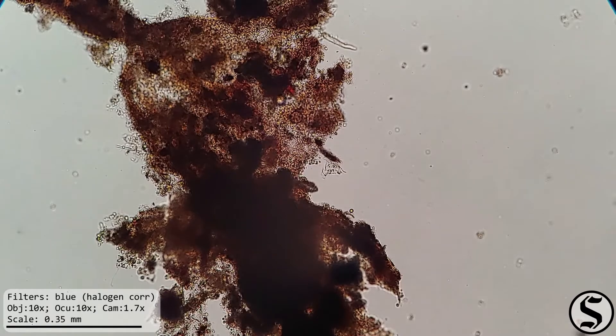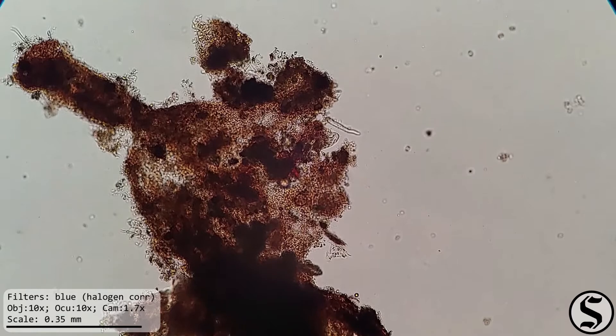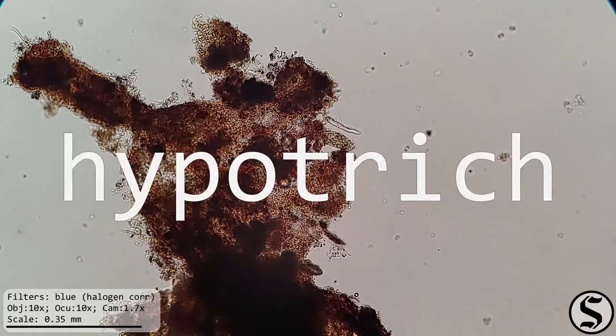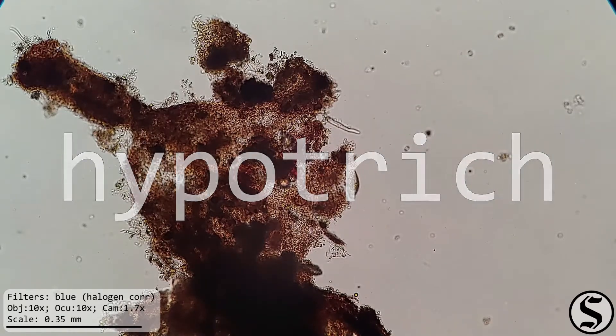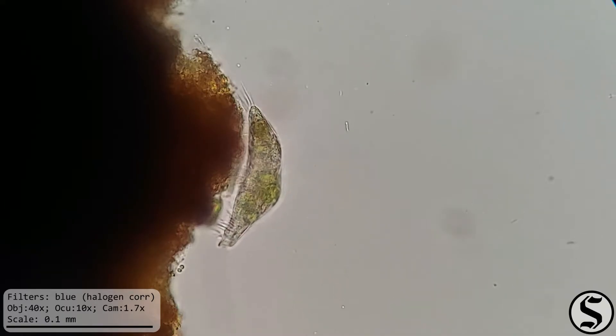And indeed, zooming in we can recognize that these are our old friends the hypotrix. If you recall, that's the Greek hypo for under and thrix for hair. This zoomed-in view is really giving us a good show of why they're called under hairs. These particular ciliates have plenty of cilia on their underside that they use to explore the world around them.